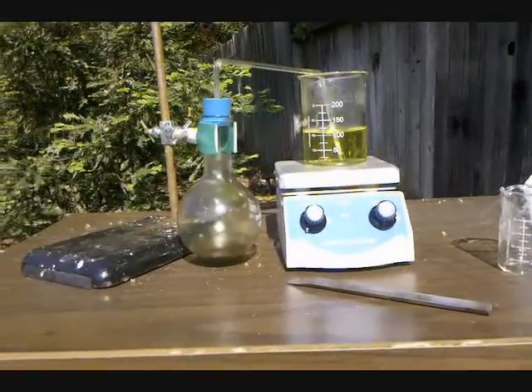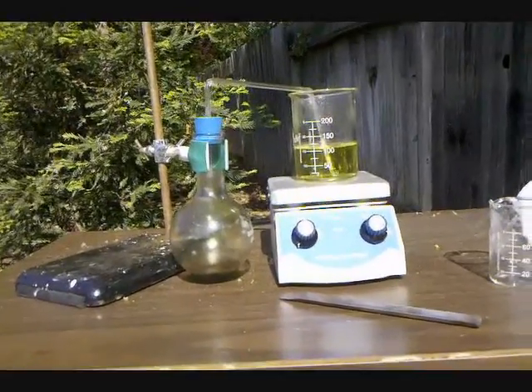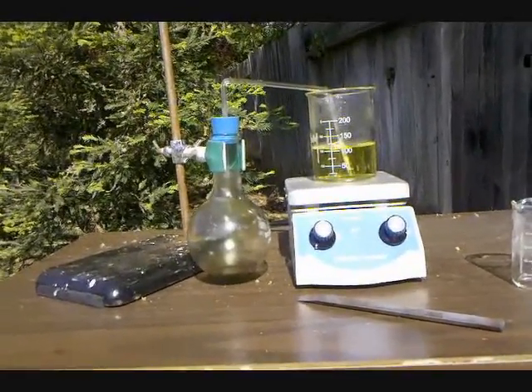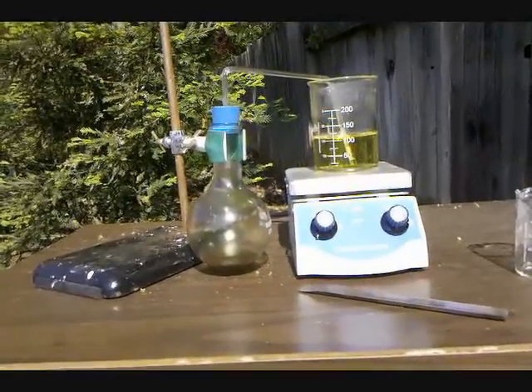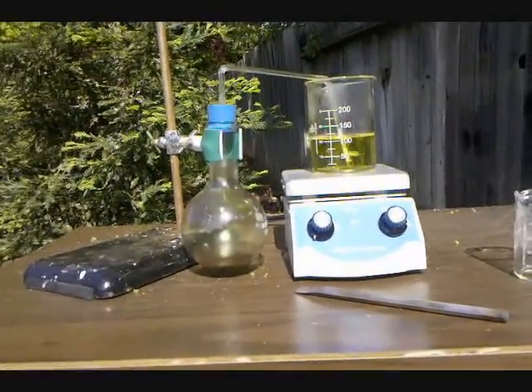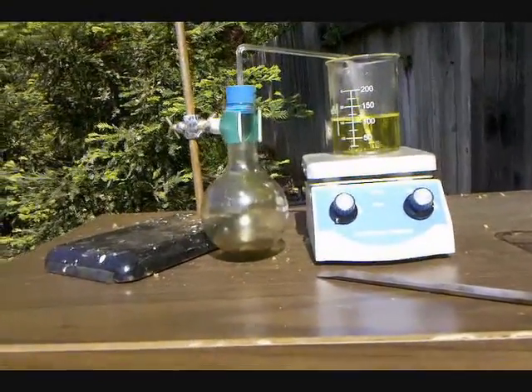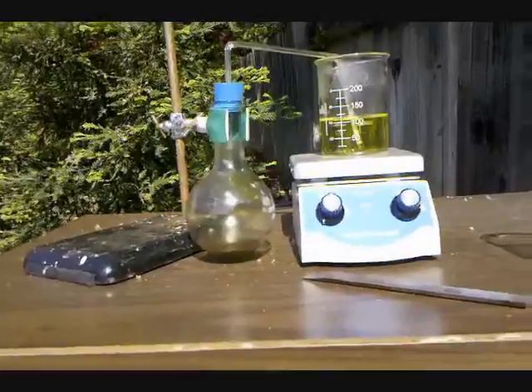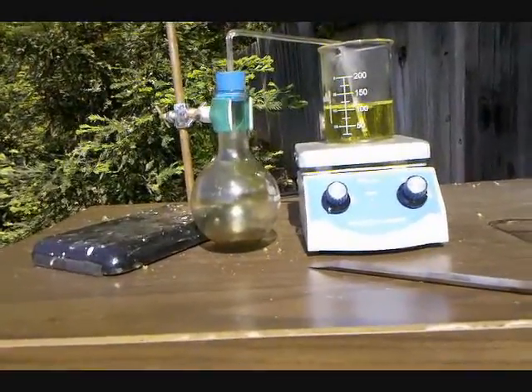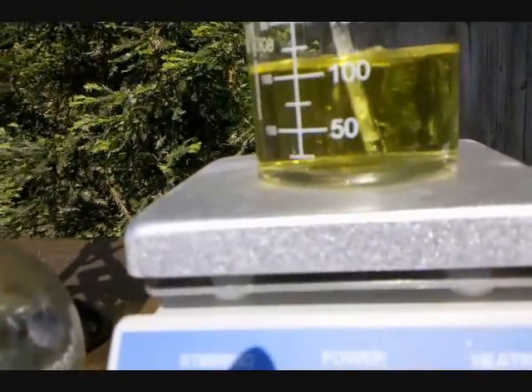Here we have the preparation of potassium periodate using the chlorine capture method. In the beaker serving as our reaction vessel, we have 8.75 grams of potassium hydroxide and 5 grams of potassium iodate dissolved in a little over 100 milliliters of water. In the round bottom flask on the left, we have potassium permanganate reacting with hydrochloric acid to produce chlorine gas, which is traveling into the beaker and bubbling out the bottom of the tube.